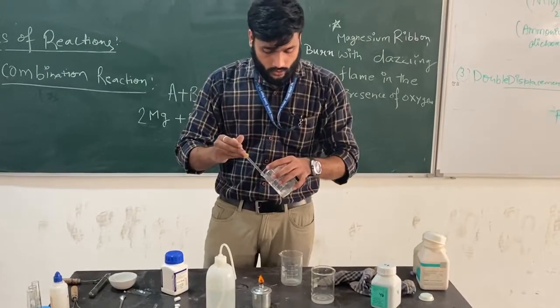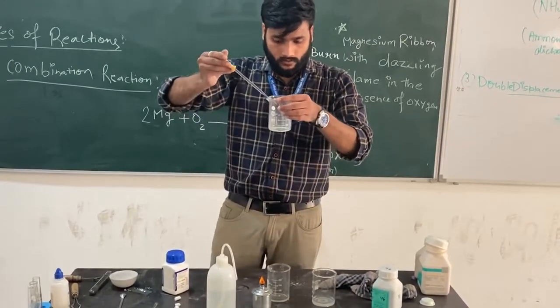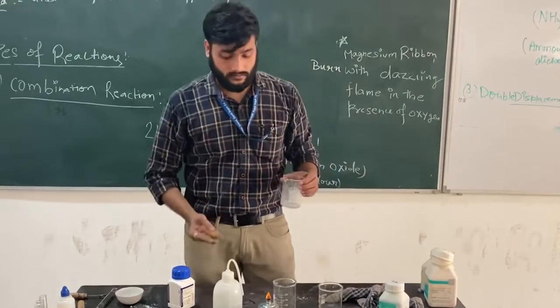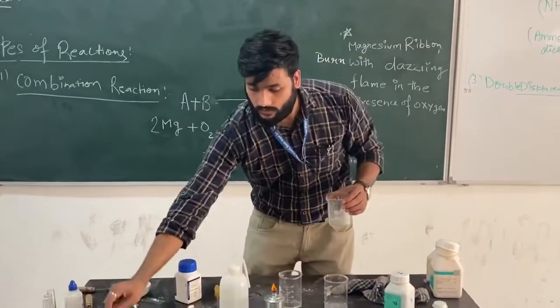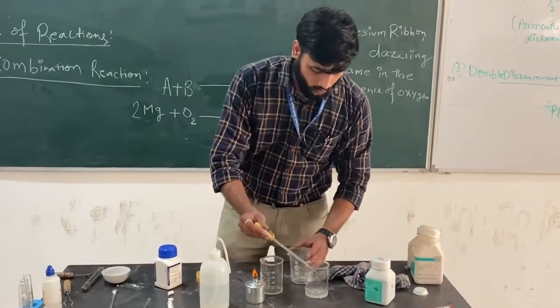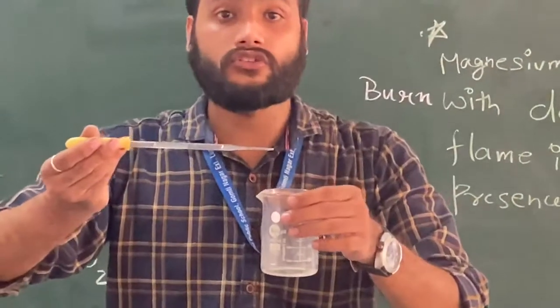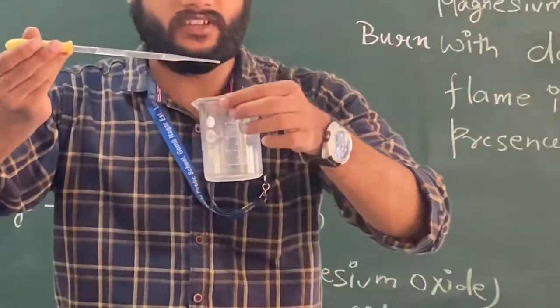I'm going to take a few drops of lead nitrate and a few drops of another solution. Now observe the change, please.